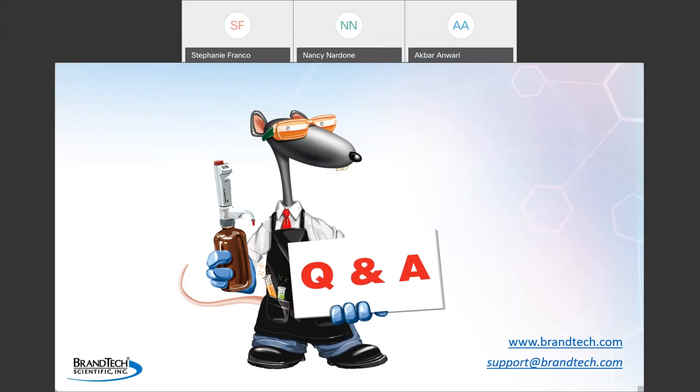Okay, great. Another question that has come in, Nancy, is are there advantages or disadvantages to using digital or analog thermometers when doing the calibration testing? I don't think there's any advantage or disadvantage to digital versus analog. I think the accuracy is really the question, as long as you're confident in the accuracy of your thermometer. Ideally, you want it to be accurate to plus or minus 0.2 degrees Celsius. That's really the parameter that you're looking for.